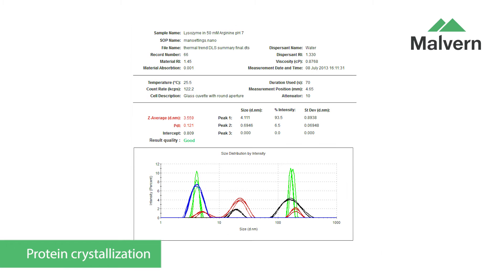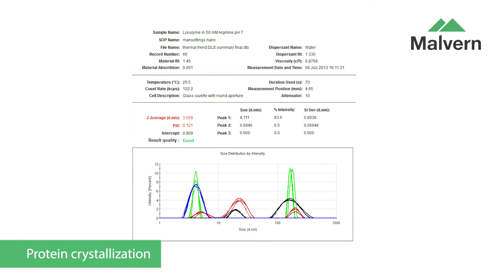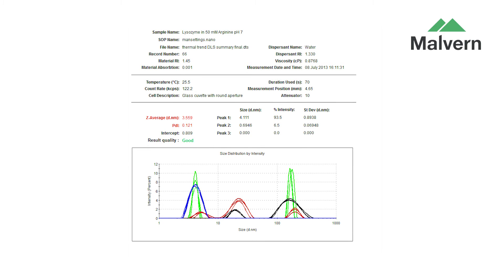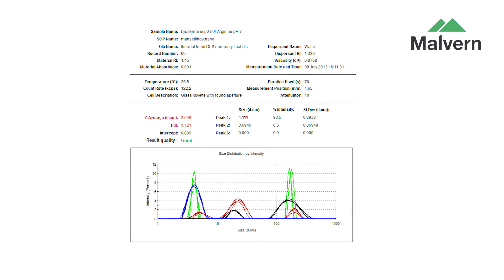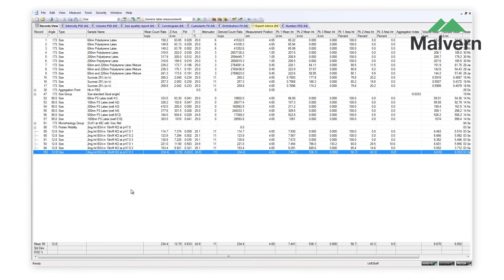Protein purity is important in the production of crystals for determining the molecular structure by X-ray diffraction. The Zetasizer APS requires only minimal amounts of sample, and enables you to automate the screening of a large number of buffers until the ideal conditions for protein crystallization are found.